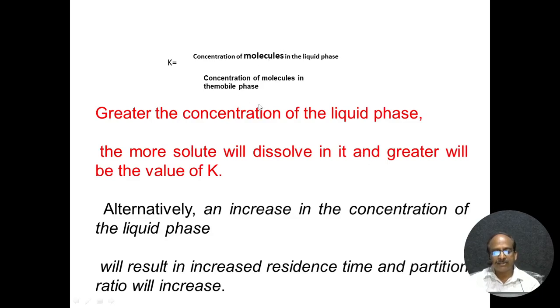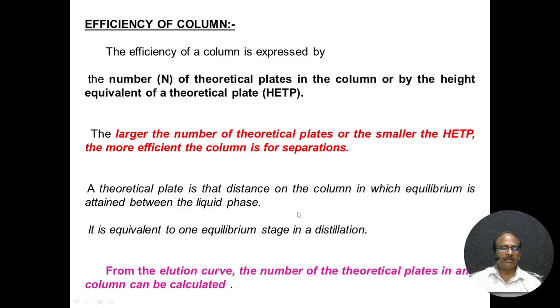Suppose you take a greater value of K: the greater the concentration in the liquid phase, the more solute will be dissolved. Alternatively, if you increase the concentration of the liquid phase, the residence time automatically increases, and the partition ratio increases.